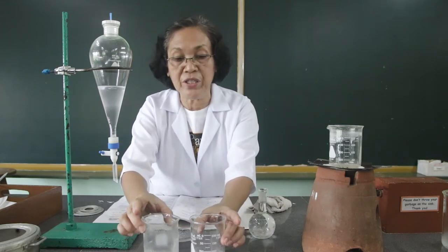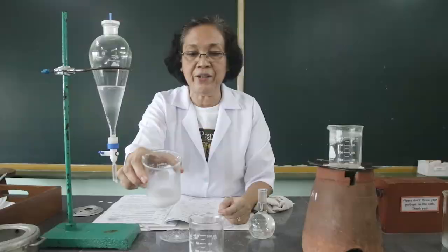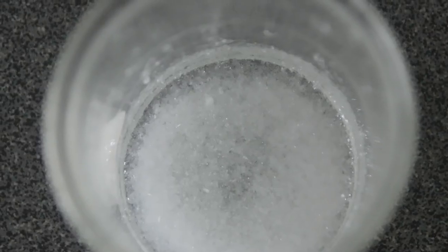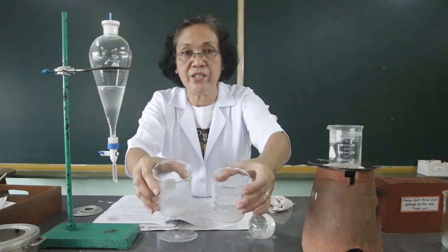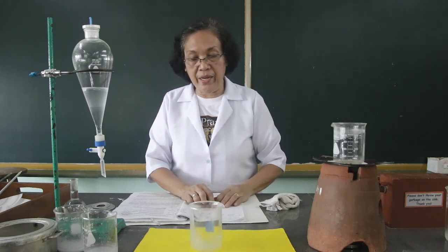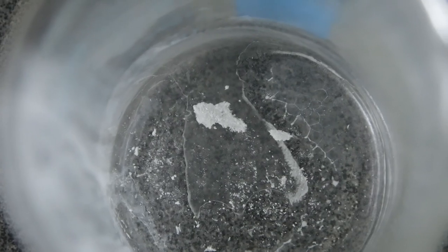We are now going to make observations for the first part of this activity, that is on recrystallization. This was the acetanilide which was placed into the cold water bath, and this was the acetanilide filtrate which we only cooled at room temperature. I want you to compare the size of the crystals. I also want you to observe the result for the extraction process, wherein we extracted the benzoic acid using the separatory funnel when it was mixed with the sugar solution. After evaporation using the water bath and the fume hood, this is now the result. That would be all for the activity on separation and purification of organic compounds. This is your teacher, Professor Lizitas Ruiz of Holy Name University.